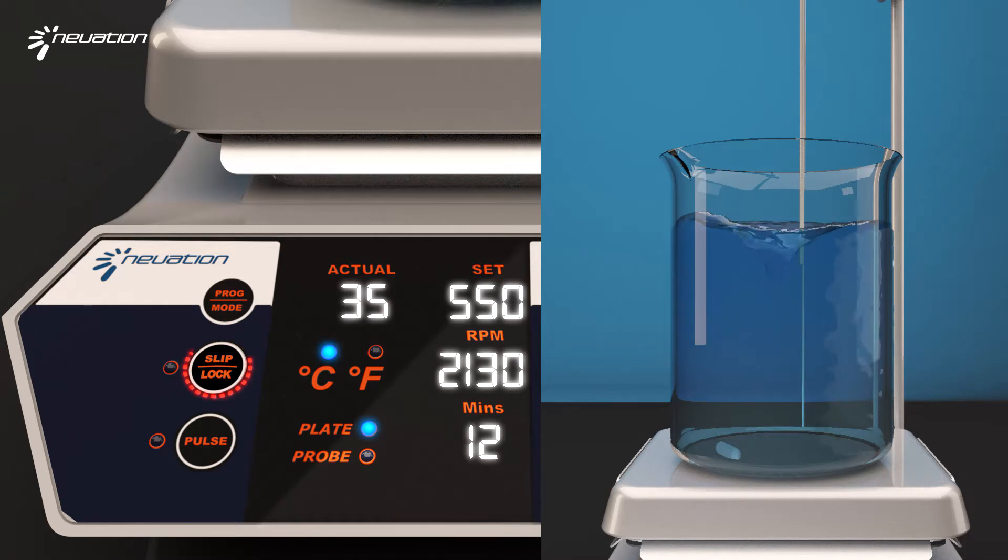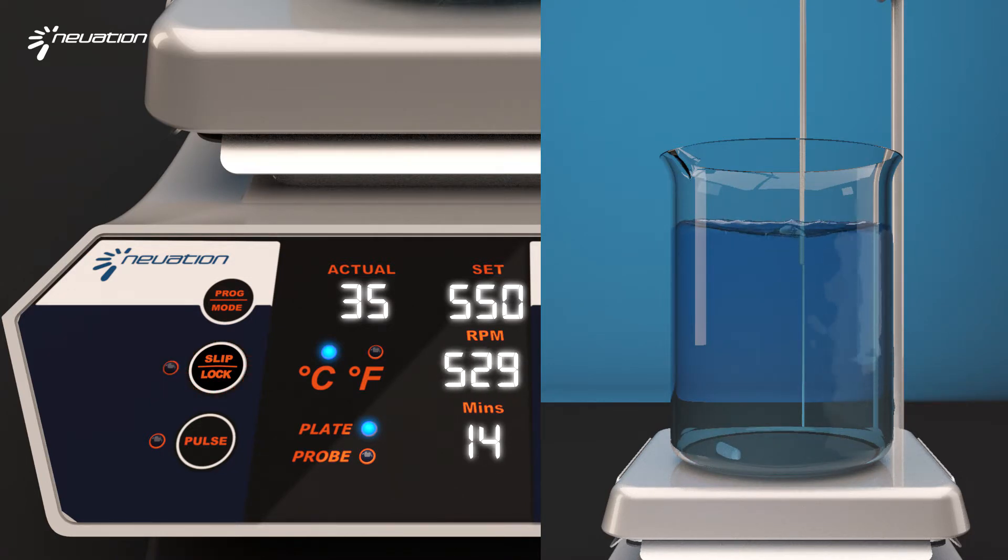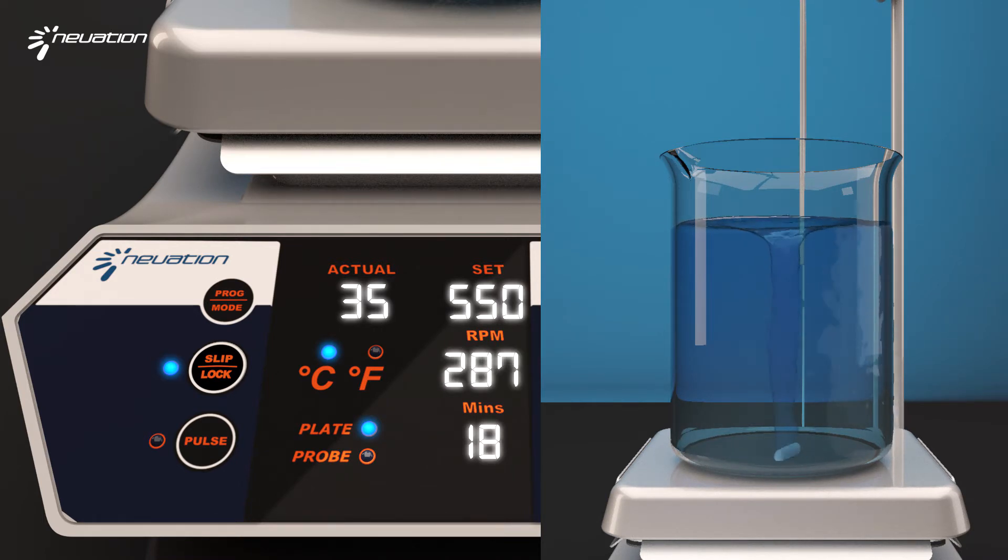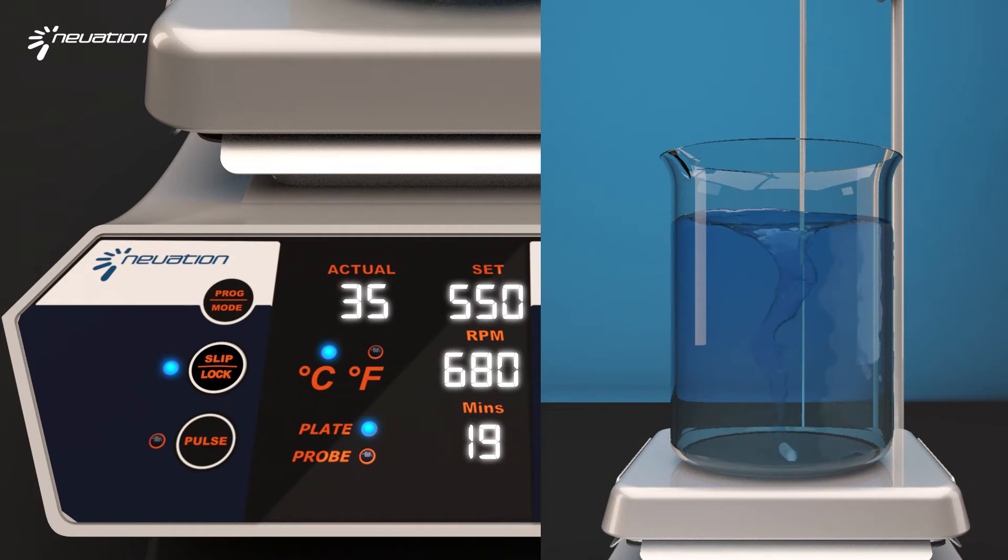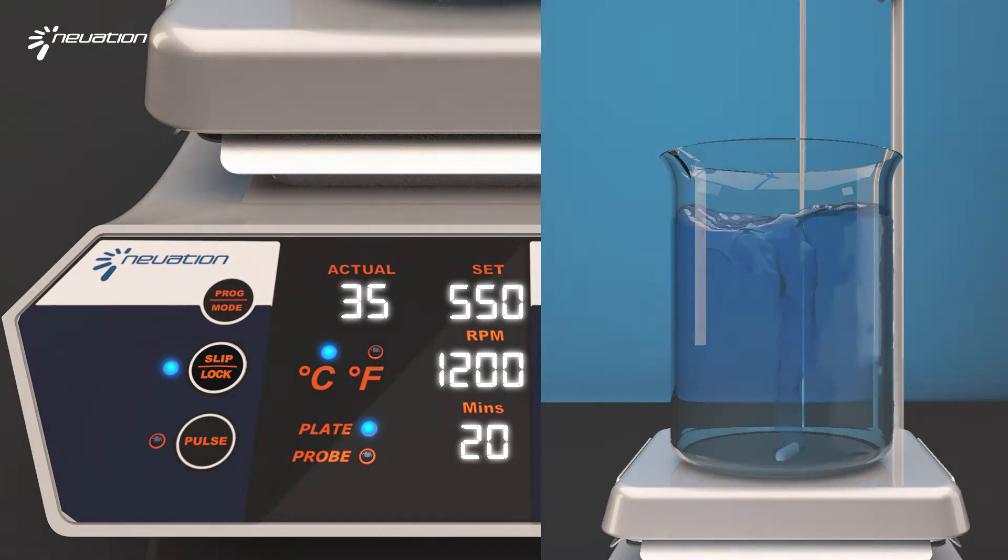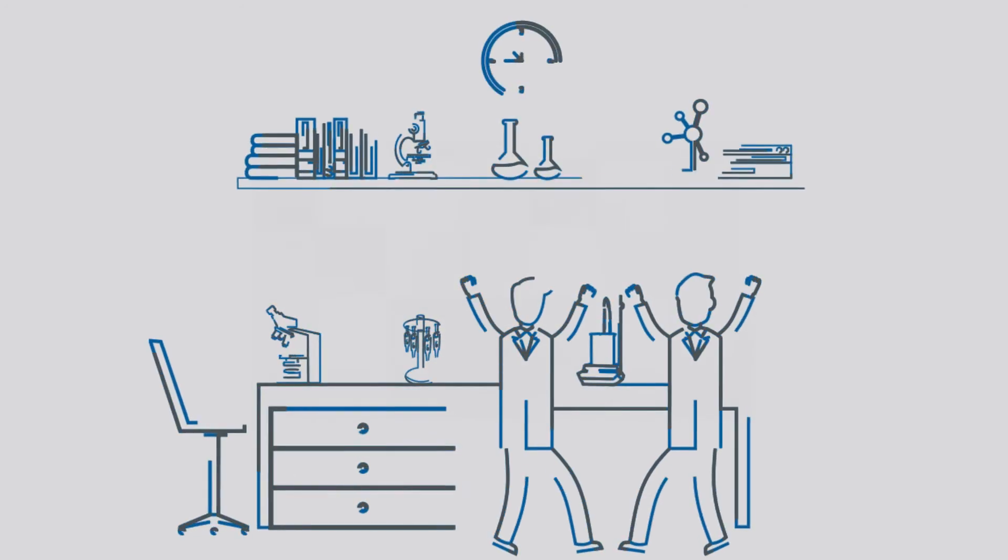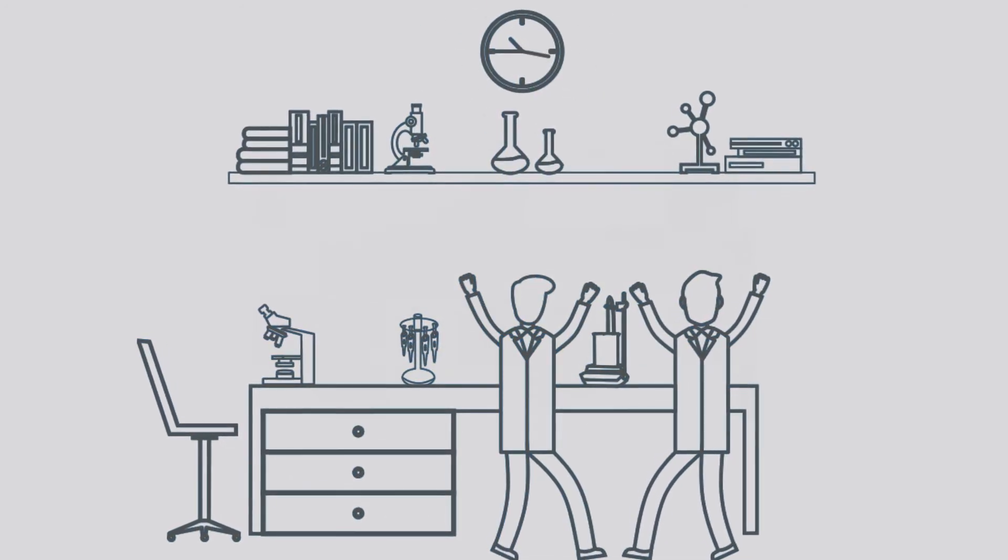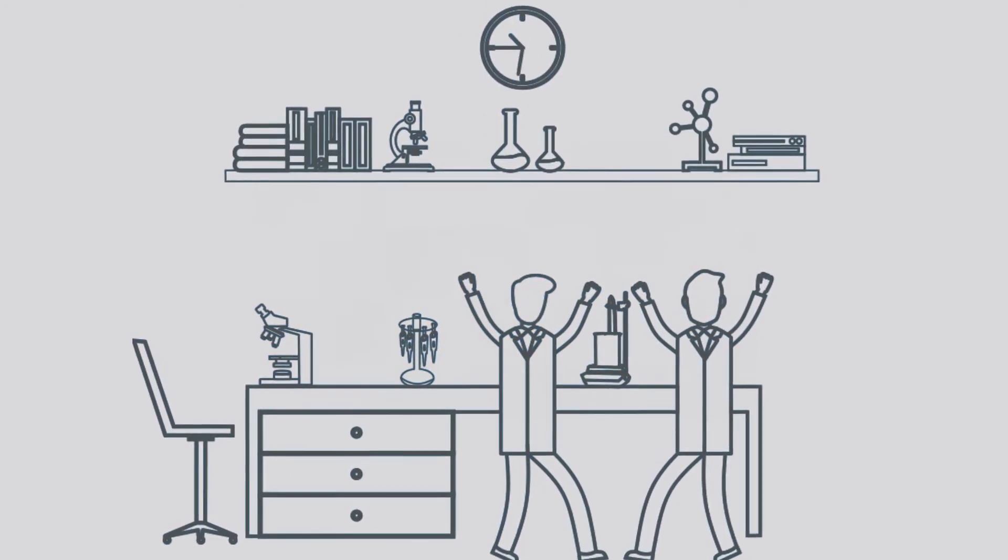In such an event, it stops the motor automatically, brings the bar to the center, and begins stirring with reduced speed by 100 RPM. All this happens in the absence of the user. This is how we change the way labs work.